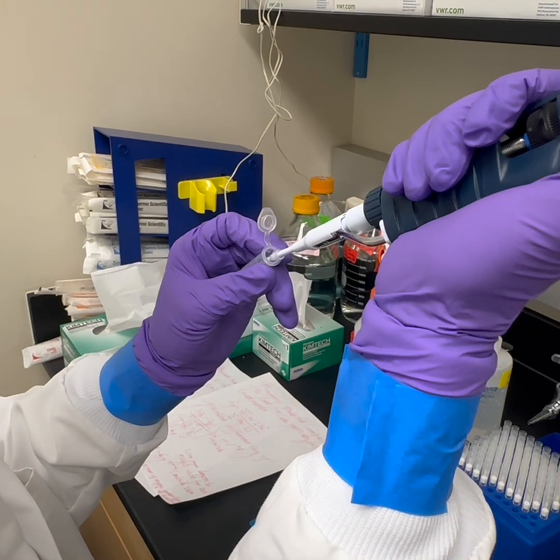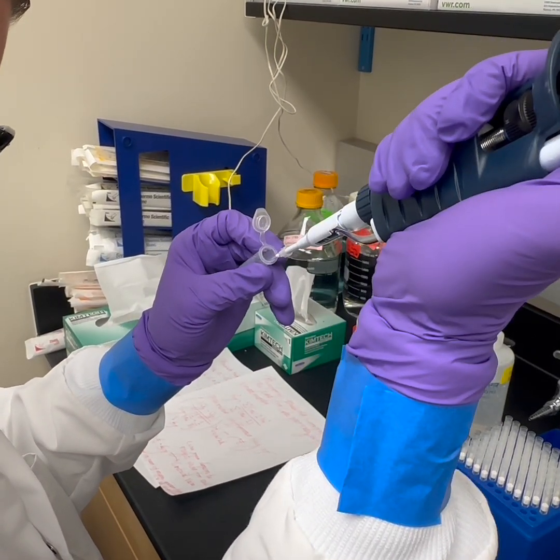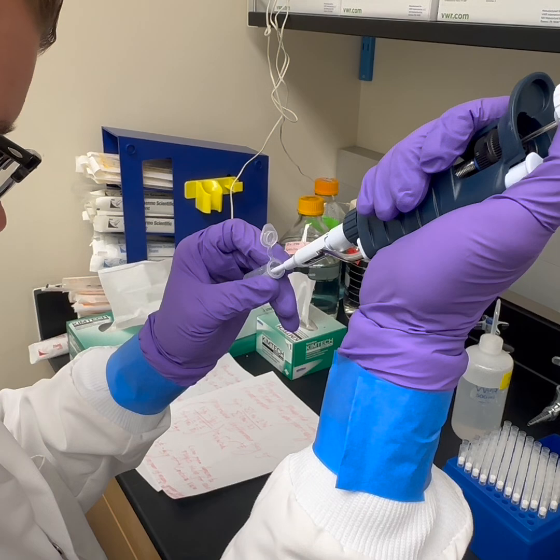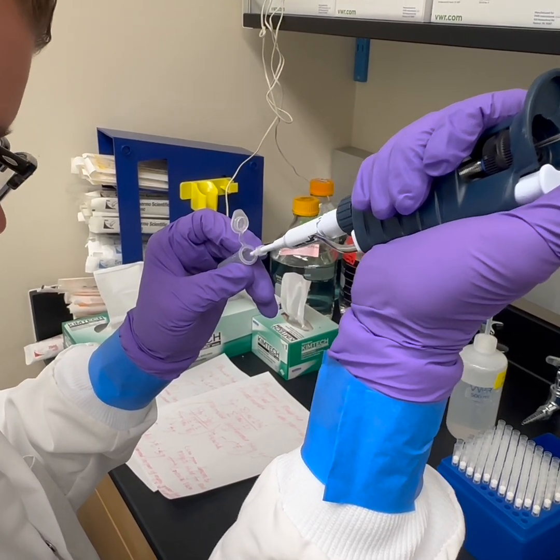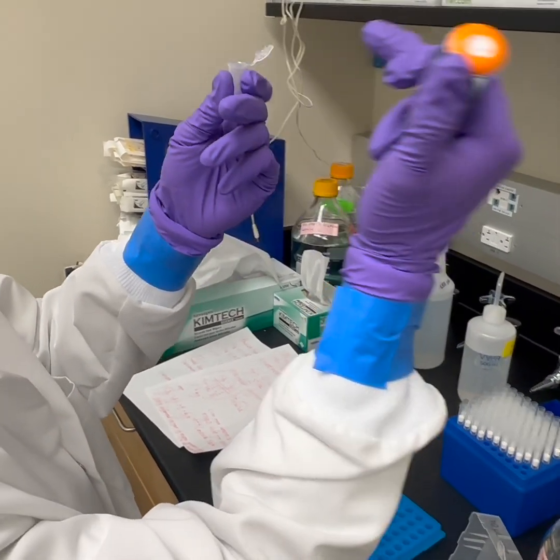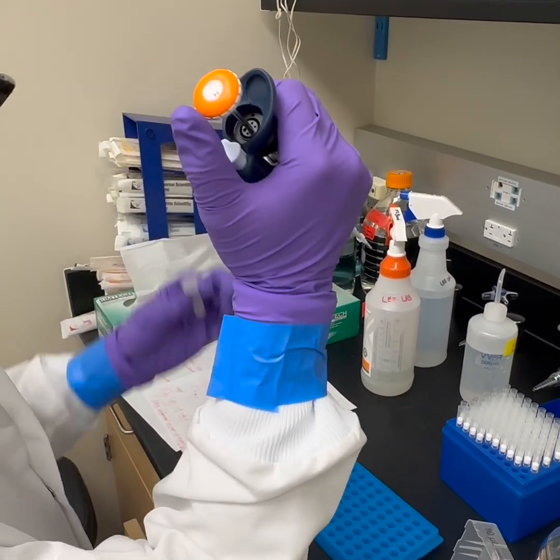That's not an ideal method, but kind of trial by error. Now you'll see it's at that mark. So I know there's 2 microliters in here because I know that the tips are accurate.